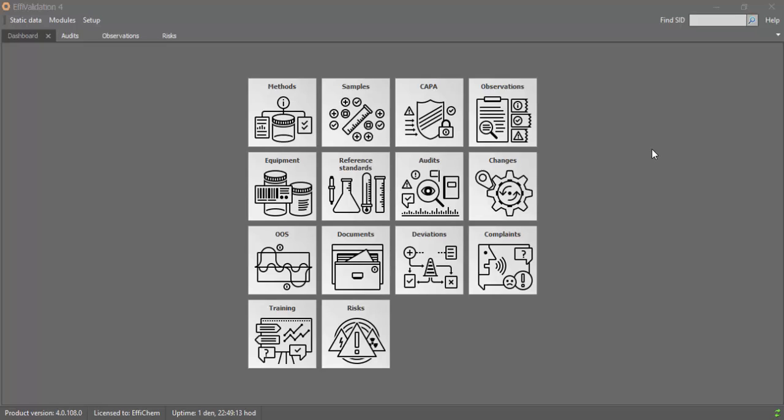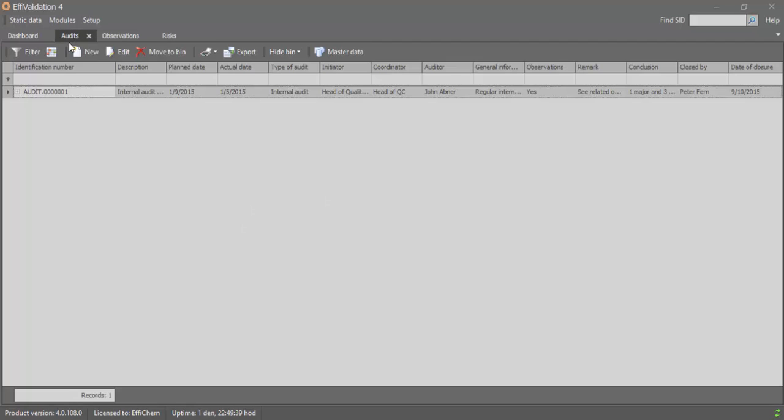All of these modules handle separate parts of the quality process. They are designed to be separate because each component is easier to manage, and auditors, either internally or externally, will need to trace each separately. But importantly, they can be linked together to cross-reference each part of a quality process. Here's an example. Let's say we have an internal audit.